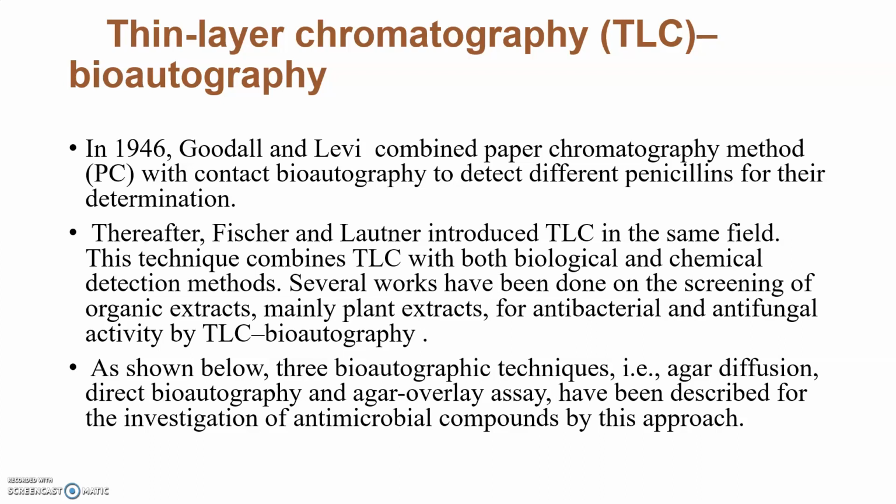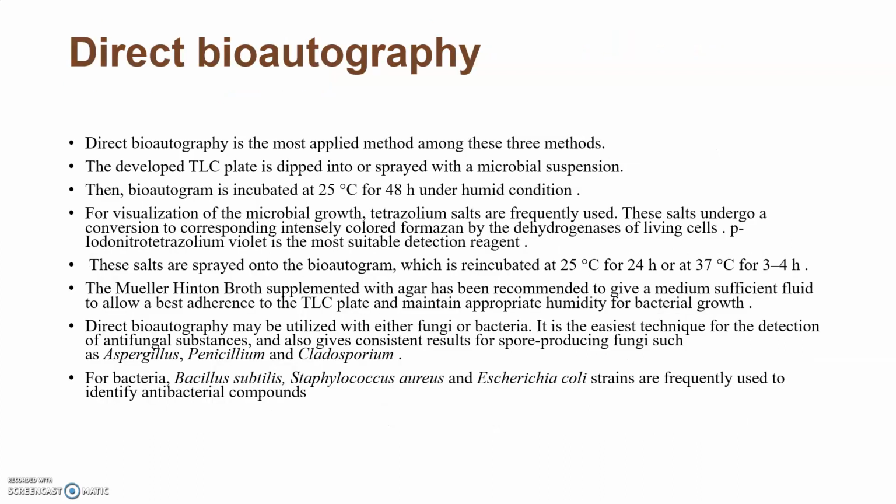Here, three bioautographic techniques, agar diffusion, direct bioautography, and agar overlay assay, have been described for the investigation of antimicrobial compounds by this approach. Direct bioautography is the most applied method among the three methods.